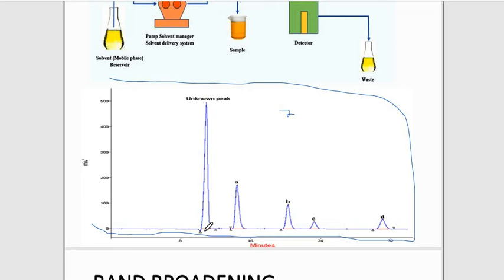Now, the values that each of them displays on the x-axis are what we call the retention times of the analyte. So when I take, let's say, my peak A, its corresponding value on the x-axis, if I trace this, the difference between here is 8, here is 16. Let's say when I trace this one down, the A peak has a value on the x-axis that, let's assume, is 14. That value becomes the retention time of peak A. When I take this particular unknown peak, which corresponds to an unknown sample too, and trace it down to the x-axis, the value here, which let's say is roughly 10, corresponds to the retention time of that analyte. And the retention time is basically how long the analyte stays in the column.